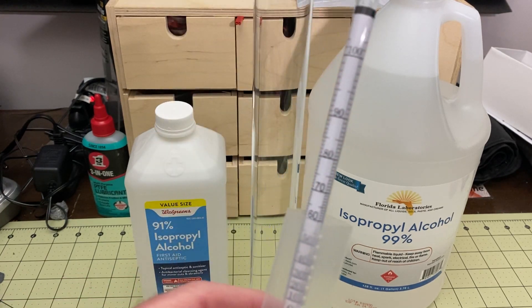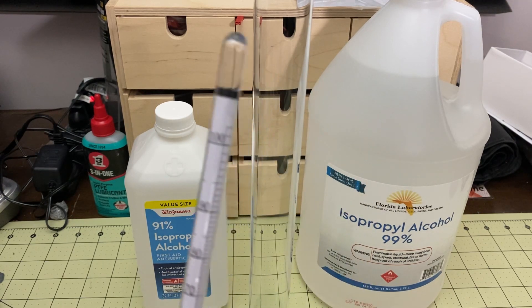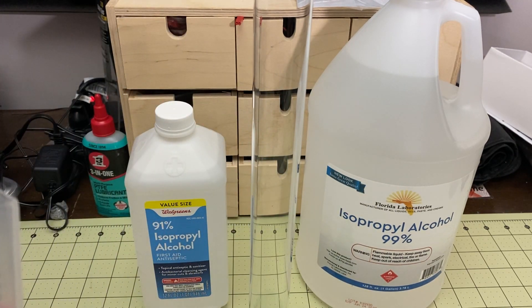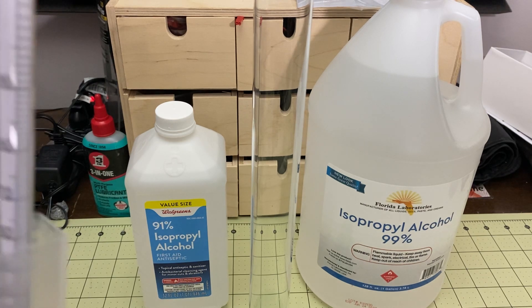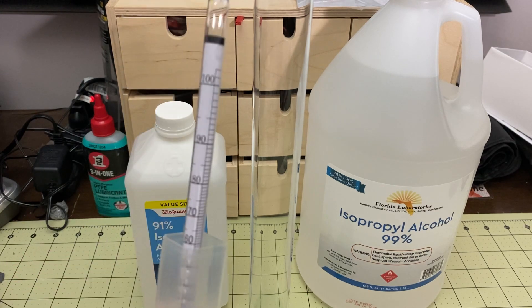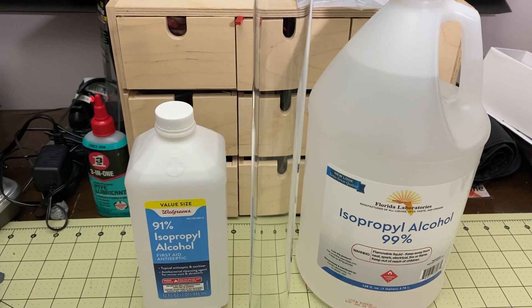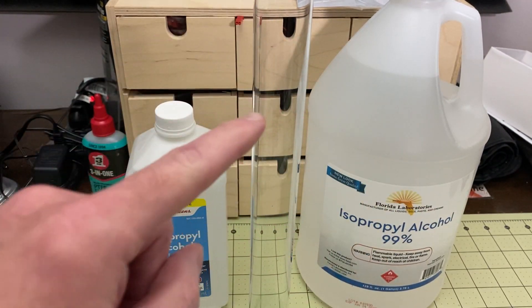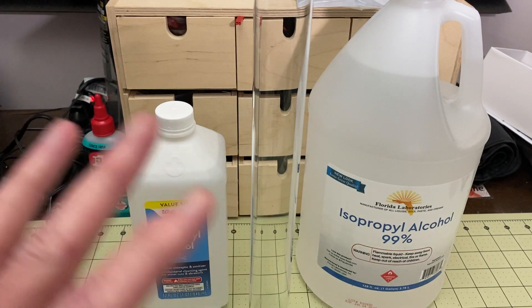We're going to test this IPA to see if it really is 99% alcohol, because there are some comments — somebody said it was really only 70%. I have tried one of these gallons and it worked for cleaning, but now that I have the hydrometer I want to verify it's really 99% alcohol for this price. I'm going to pour some into this flask until it's almost full and then we'll test it.